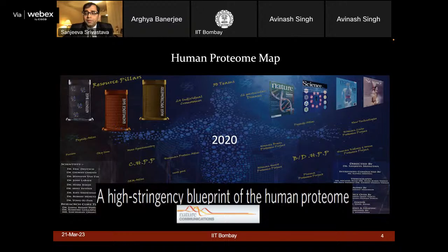Since now we are talking about high stringency criteria, and since you are the students of this course of Interactomics and Bioengineering, where you have been exposed to some of these technologies, let me briefly mention that while mass spectrometers can generate various peptide sequences, and you can look at a large number of protein identifications from that, as a part of protein identification you need to be very stringent in using some cutoff, filters and statistics to ensure that your search, which you're going to have based on these peptides, is confident enough to identify the protein.